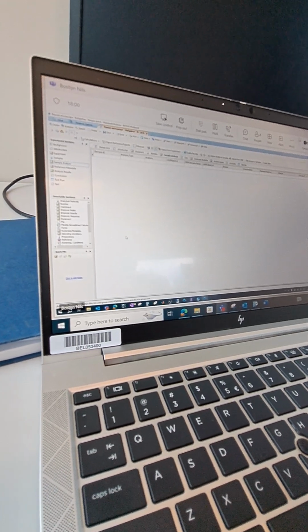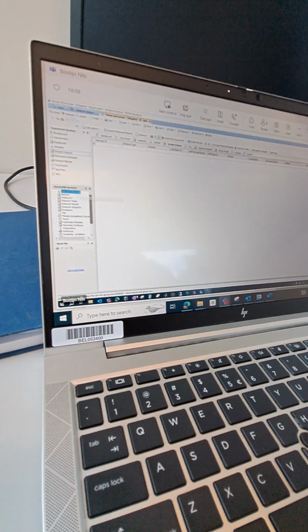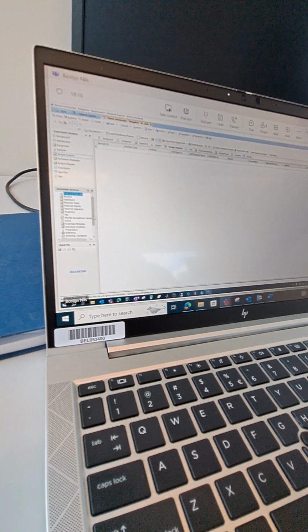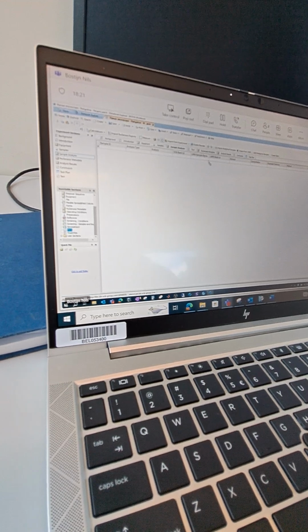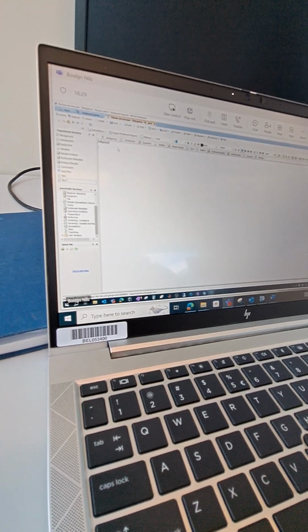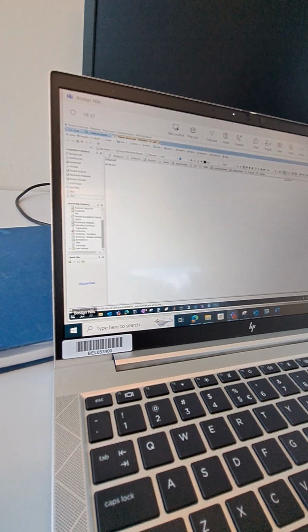What we can do is, the ones which are shown here are the standard ones, but then we can import other ones. And here you have a list of insertable sections, things you can drag and drop to here. One which is interesting is the text. So you just select it and then you drag and drop. And then you have a new empty text section, which you can write whatever you want in. You can, for example, insert the date here. You have a button here, insert date.